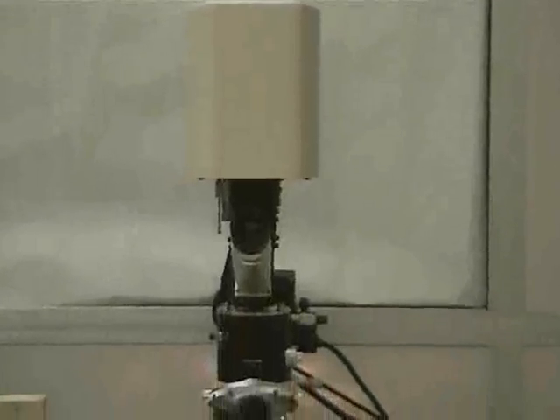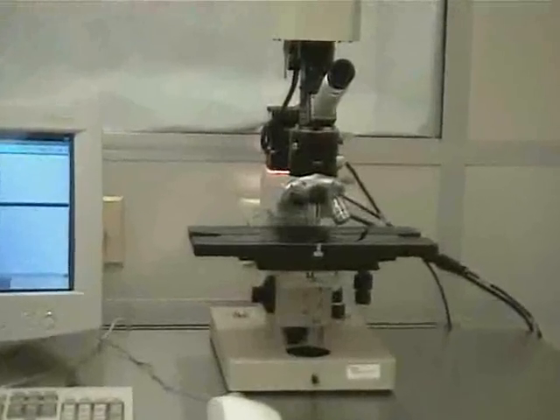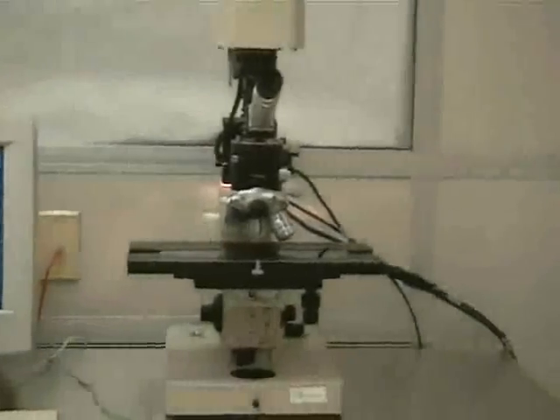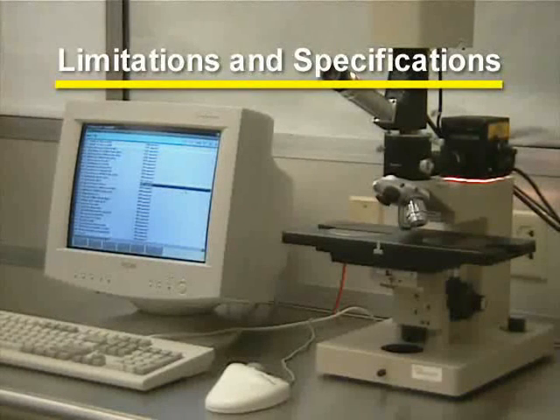The Nanospec 3000 film analyzer system utilizes non-contact spectroreflectometry to determine the thickness and refractive index of transparent films on substrates. The machine operates by the diode array spectrophotometer generating a corrected spectrum. The resulting spectral data are then compared to a bare silicon reference to determine the exact film thickness corresponding to the interference pattern. There are limitations to the Nanospec.